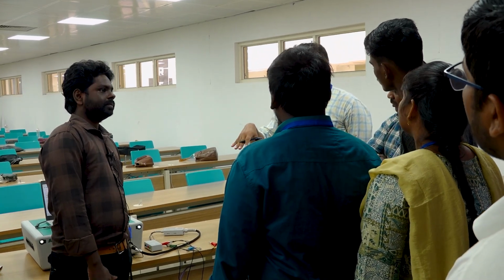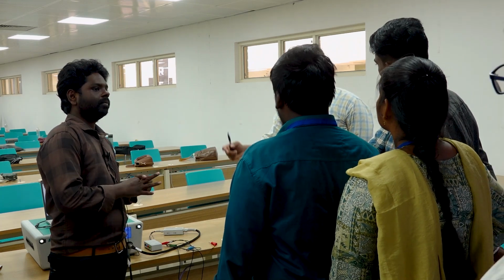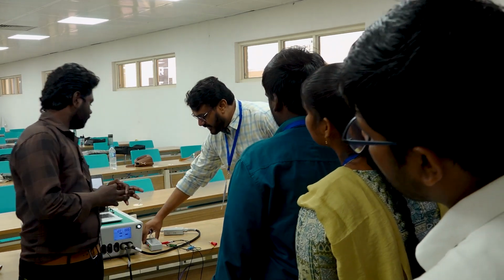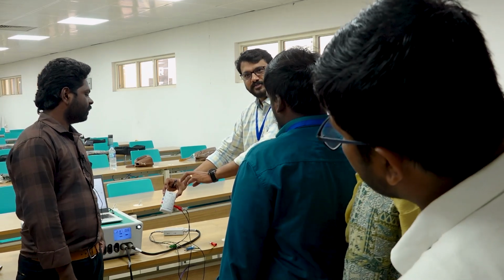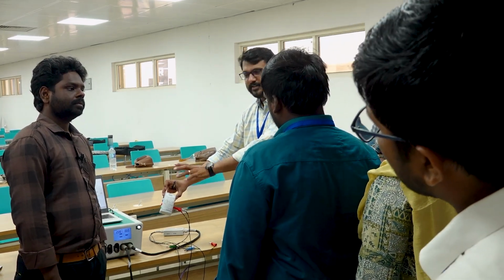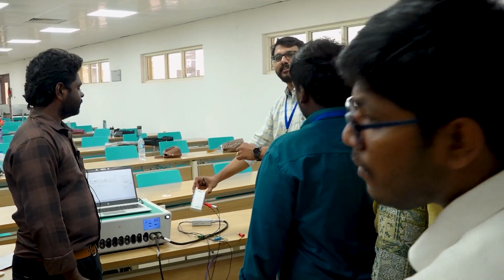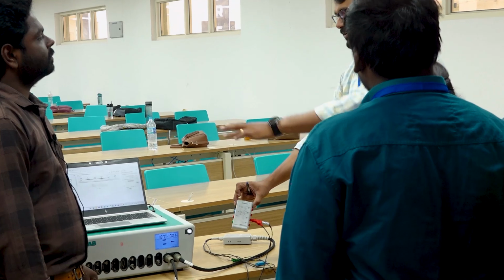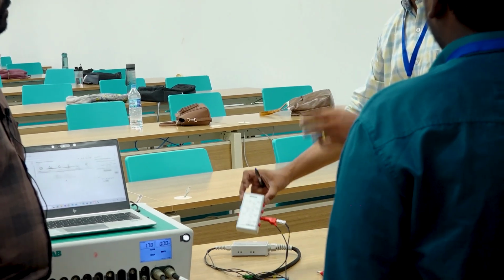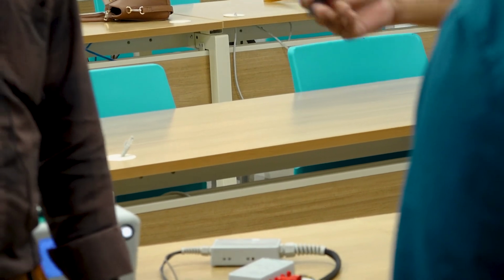Normally that is understood through this EIS analysis. This demo cell is simply an electronic device with a combination of capacitor, resistance and impedance. One combination acts as a solar cell, another acts as a supercapacitor. For ease, they made this demo cell to explain the whole technique and what we can do with it.